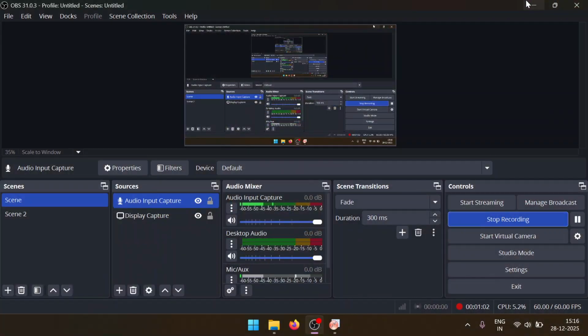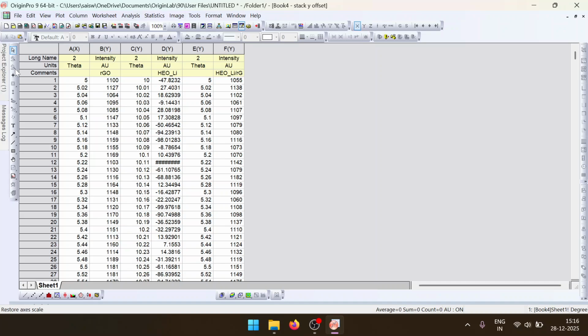I thought I'd make a YouTube video mostly about the different kinds of plots that we can make in Origin. I thought this should not be necessary for me to make, but then I've seen many people struggle with this, so I thought I'll just make one video of the various kinds of plots that are necessary or useful in Origin. And so first I'd be starting with the simple line plot.